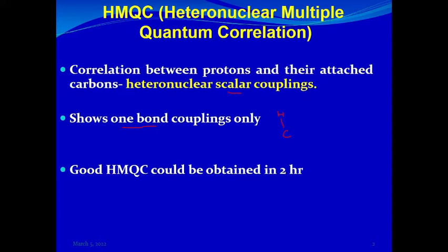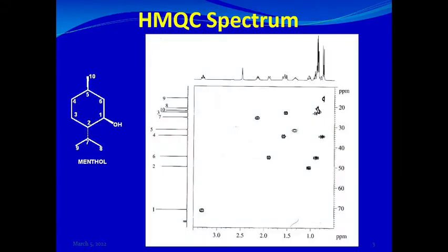Because it involves carbon, which is an insensitive nucleus in NMR, a good HMQC spectrum can be obtained in about two hours. Here is the HMQC spectrum of menthol. As it is a heteronuclear two-dimensional NMR technique, it shows a correlation between proton and carbon, so you will see both the carbon-13 and the proton scales in the HMQC spectrum.